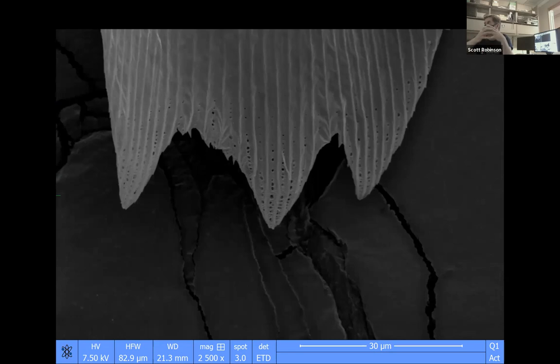And then we have evaporators that we can use. Sometimes people want to coat their samples a different way, and we can run electricity through something until it gets so hot that it starts firing off bits of itself. And so we can coat other things with gold and gold palladium and platinum and copper and whatever somebody else wants to coat. We also can coat samples just with plain carbon. The whole thing is that we need to be able to get a fine coat that's not too thick. Carbon is conductive, but it's not as conductive as gold palladium for what we're doing.